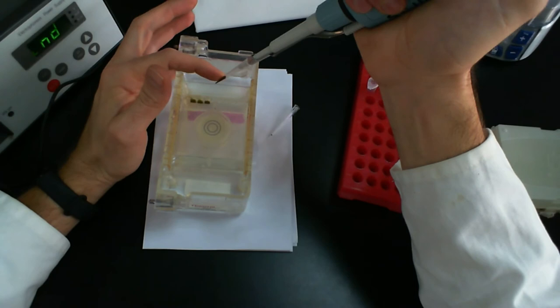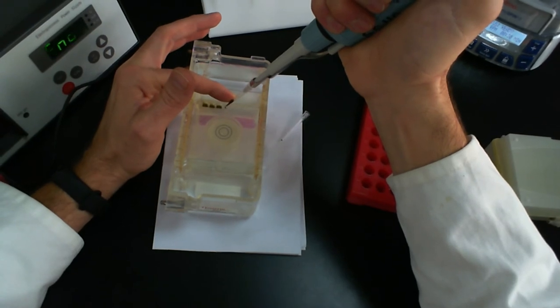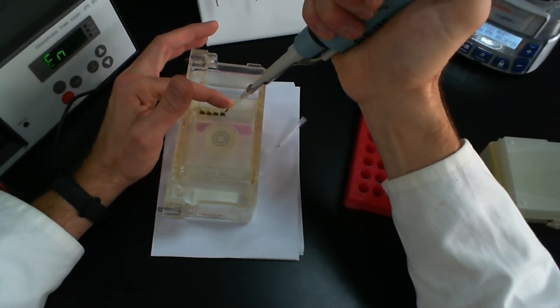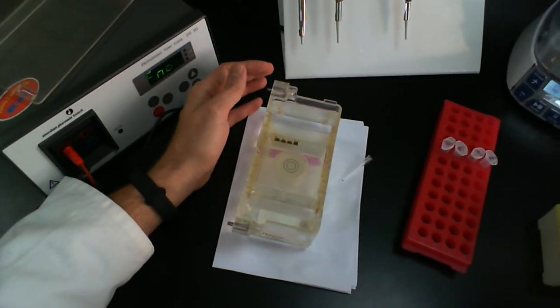Again, use your finger to guide the tip into the well just at the top. You can see it's starting to already leak out and go to the bottom of the well. That's the density working for you here. And again, just very slowly release. Okay, and then there you go. That's my four samples loaded, and I'm ready to go.